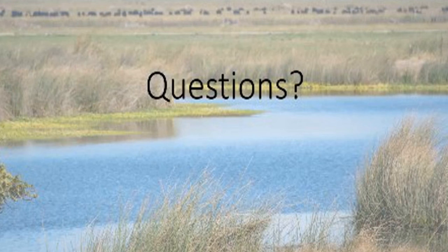No problem. If there are no other questions from the group, I had one last question, Sarah. It was so fun to hear about all of this. And I was curious if you have an approximate timeline to develop a new CRISPR or Sherlock assay, if we had a new target species of interest. So I think, yeah, work is currently being done on the zebra quagga mussel assays. I want to say, yeah, a year. A year. Okay. Or more.